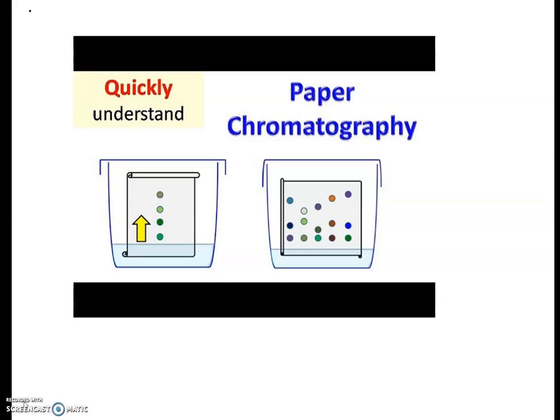Here we are using paper chromatography because we are using the stationary phase as paper. There are a stationary phase and mobile phase. So the stationary phase in paper chromatography is a paper, so it is known as paper chromatography.